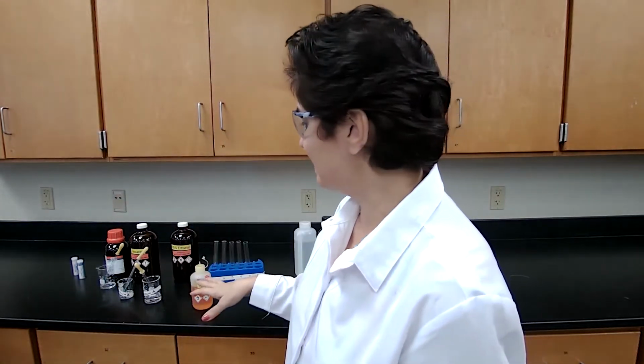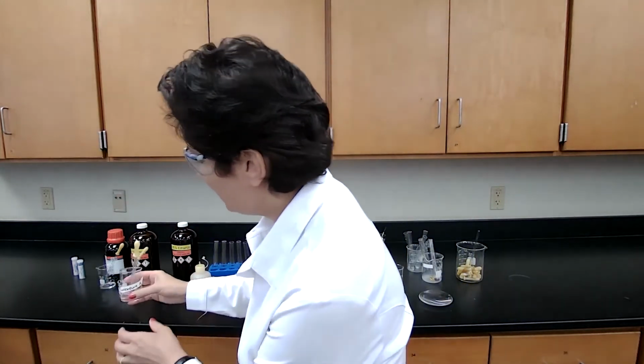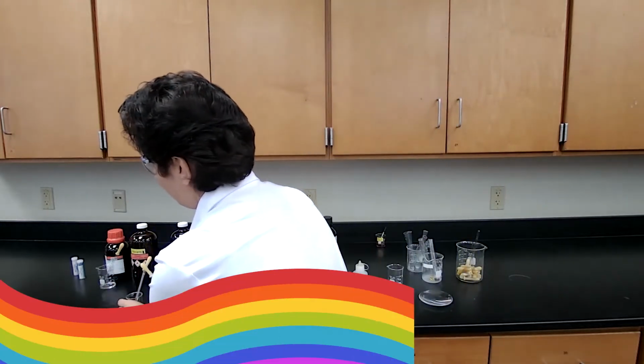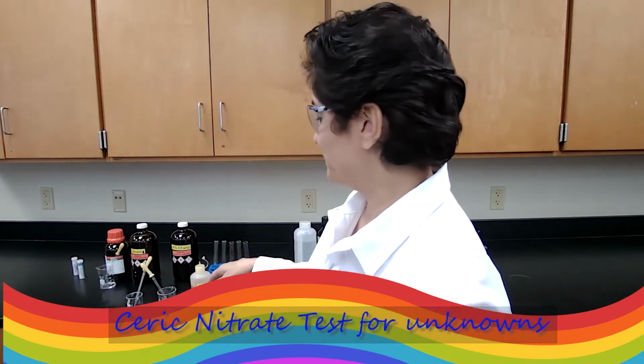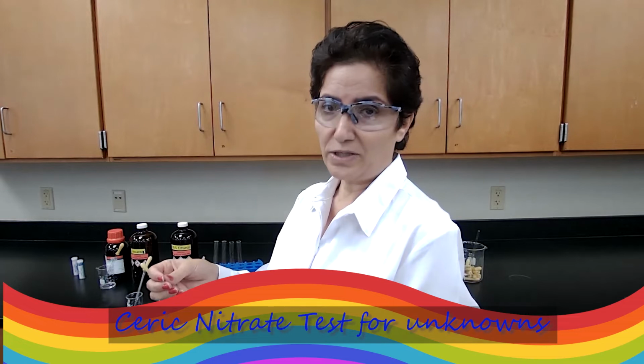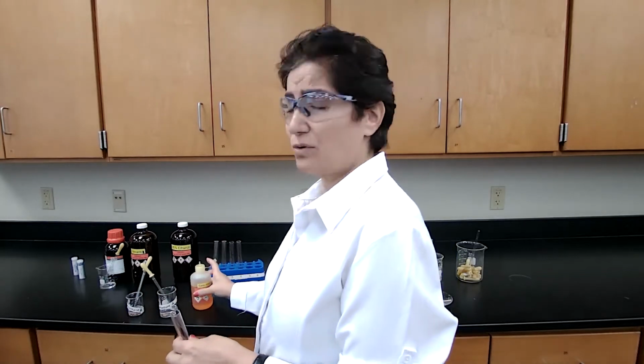Now we have 2 unknowns here, our unknown A and unknown B. Based on the observation, I want you to record your observation and write the conclusion: is it alcohol or is it not alcohol? Because it's a qualitative test, we can't determine exactly which alcohol.